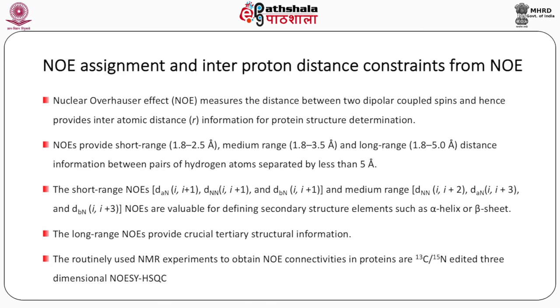The long range NOEs provide crucial tertiary structural information. The routinely used NMR experiments to obtain NOE connectivities in proteins are C13 or N15 edited 3-dimensional NOESY-HSQC experiments.